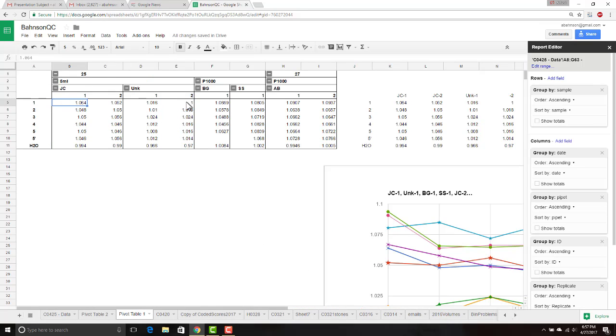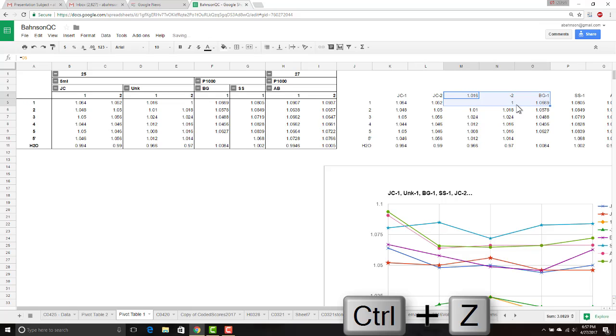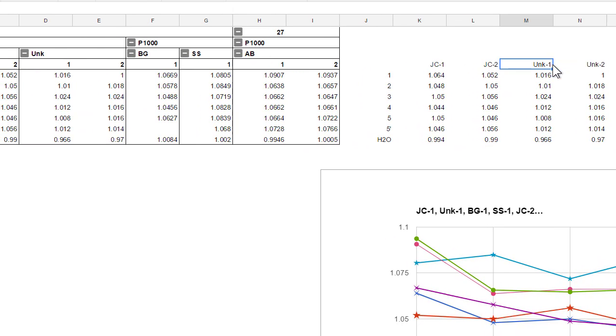This is the unknowns first. Controls. That's why I don't like the mouse. Here, if I double click, I want to add unknown. This is a new computer. I can just type UNK-2. Those are the labels I want. I got them initially by a formula, but it didn't get mentioned here along with the 2, so that's just details.